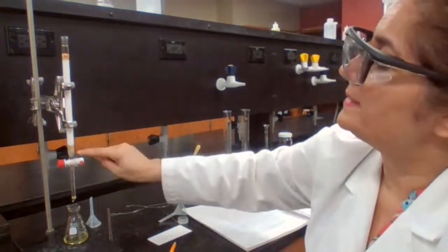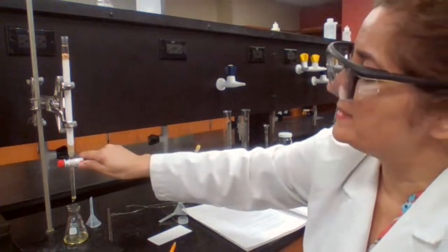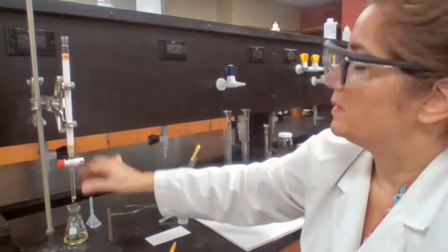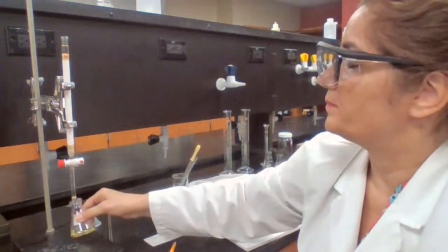Okay, I can stop now because the yellow color has been eluted completely. I can stop here.